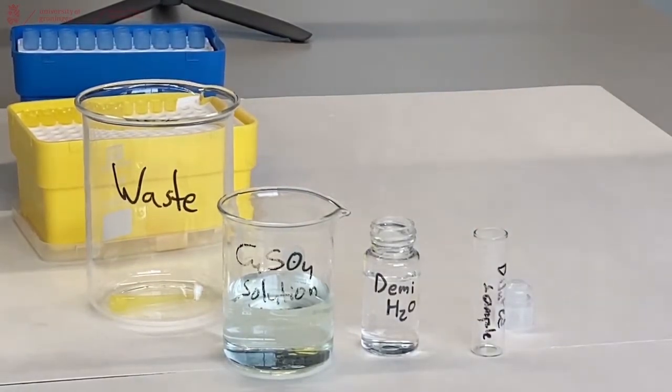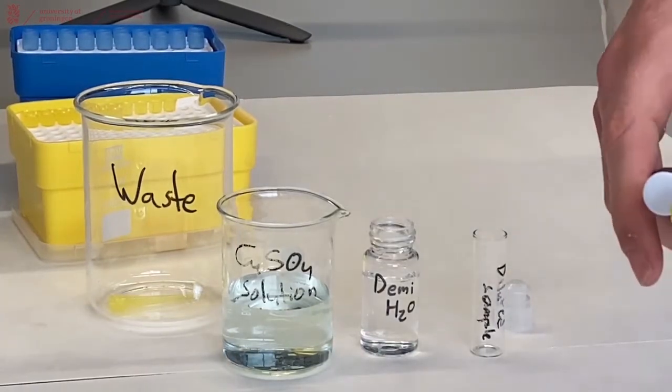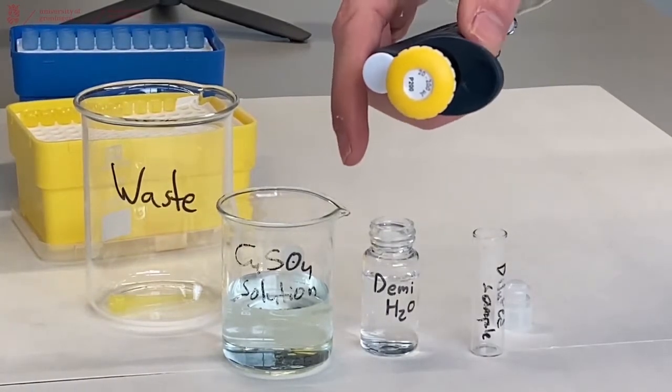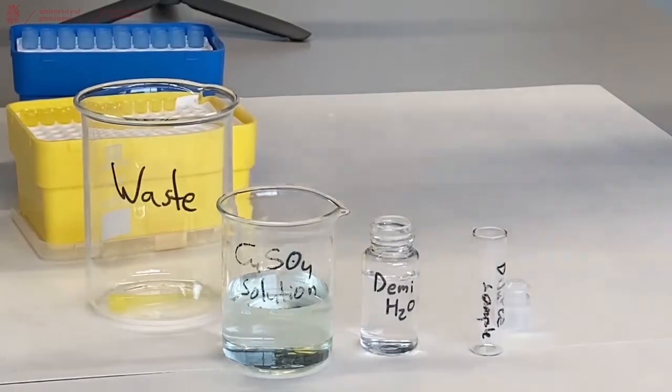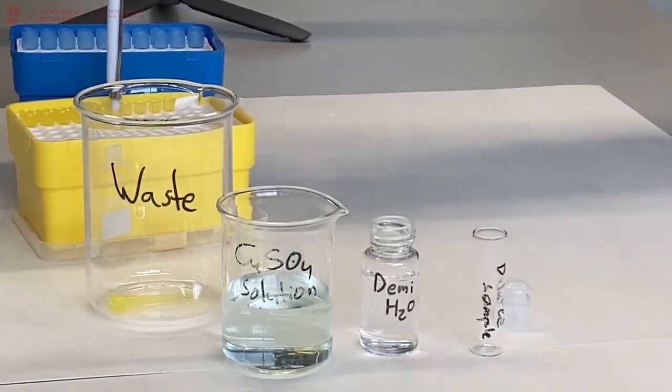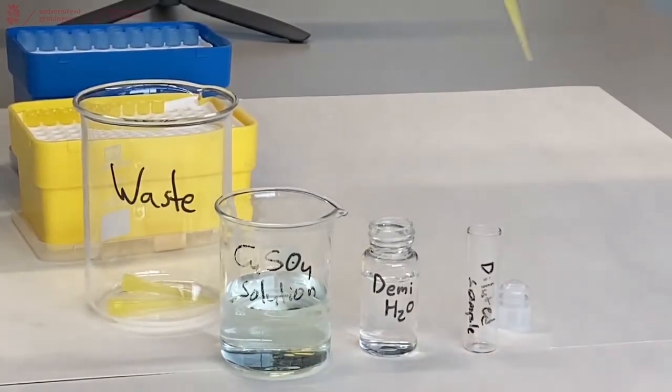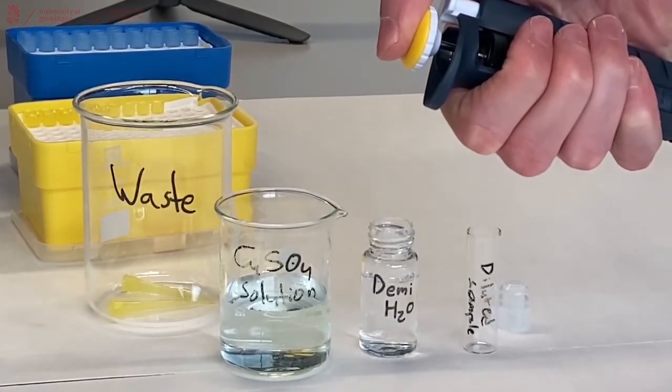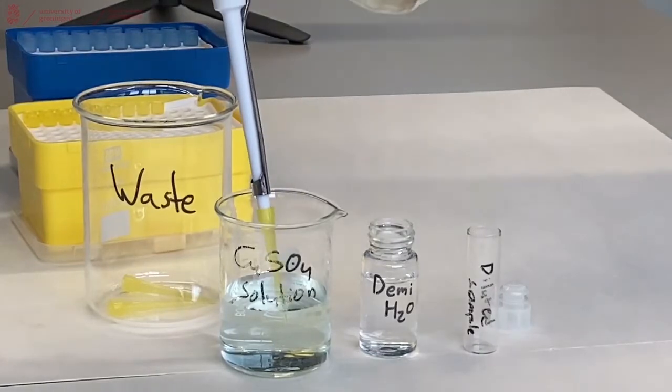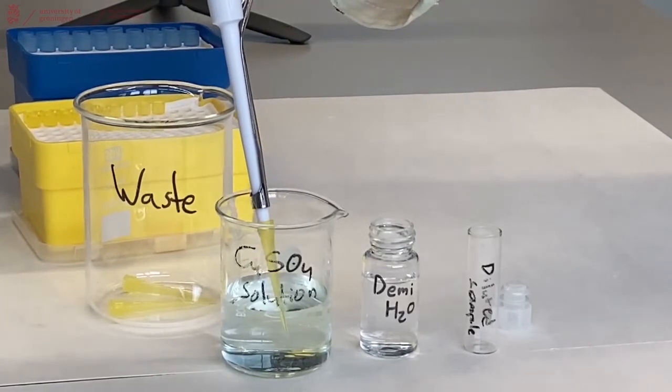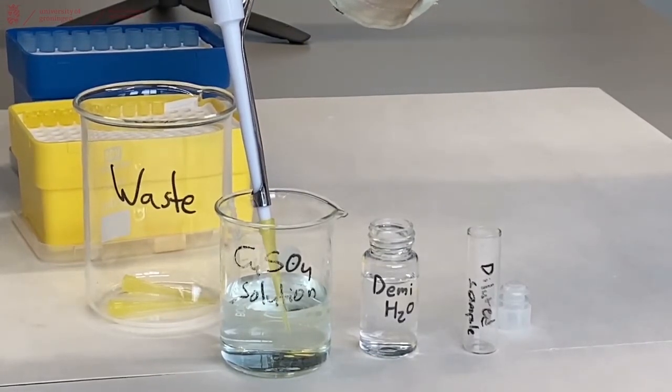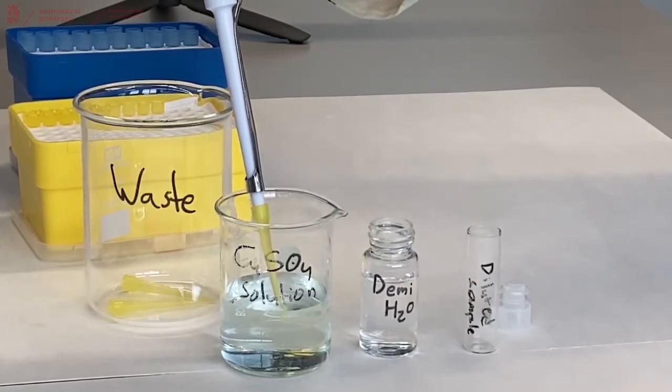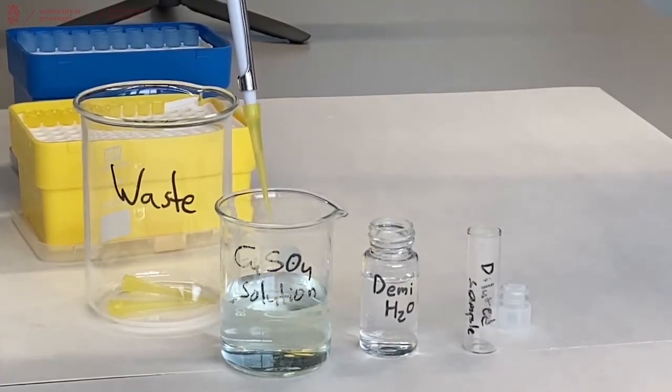First, we take our yellow pipette which is set to 100 microliters and attach a yellow tip to it. Then we carefully press the pipette to the first stop, submerge it into the copper sulfate solution, and slowly release it to suck up the 100 microliters of copper sulfate.